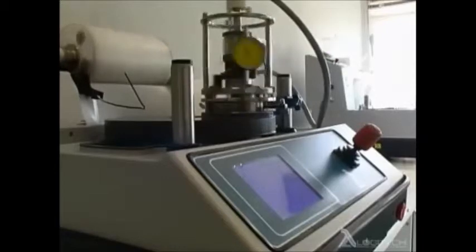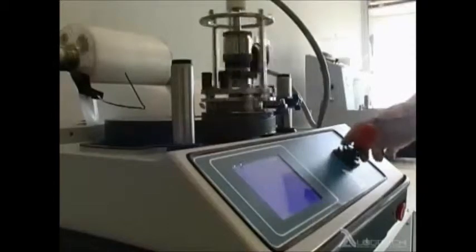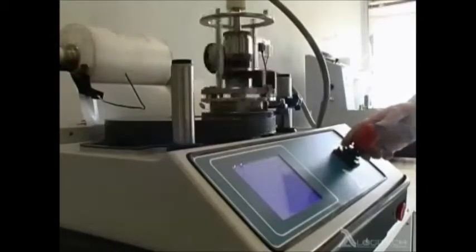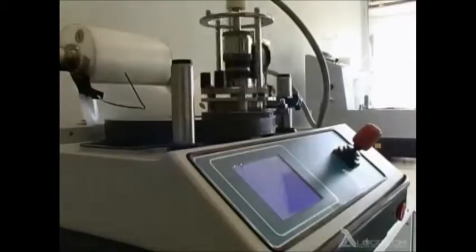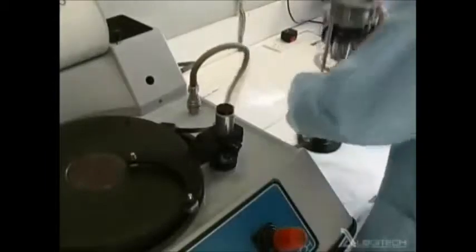When used with the PSM1 precision sample monitor and the cutout kit, the PM5 plate drive will switch off automatically when it receives the appropriate signal from the PSM1, i.e. when the preset thickness has been reached. Alternatively, the process can be halted manually as shown here.